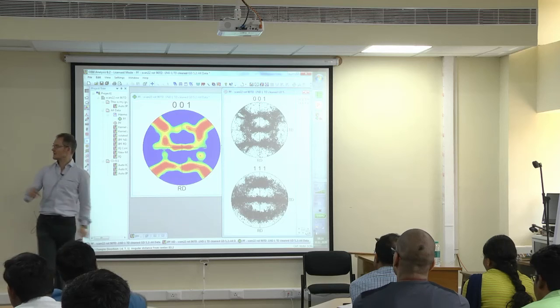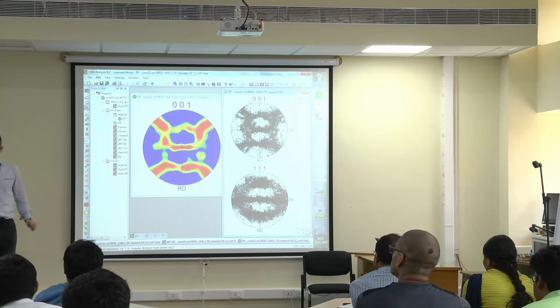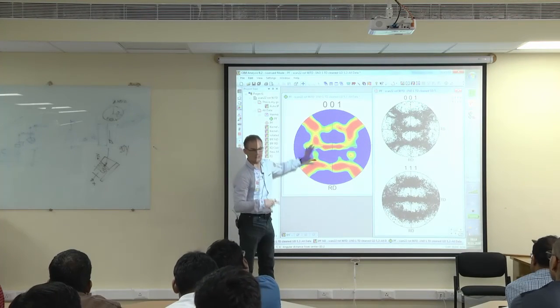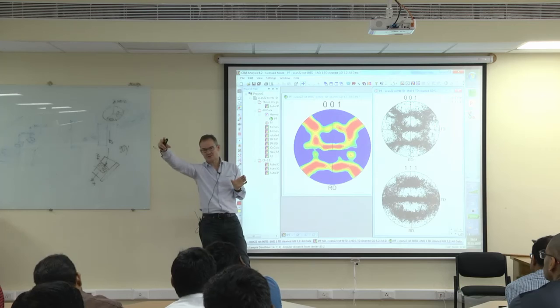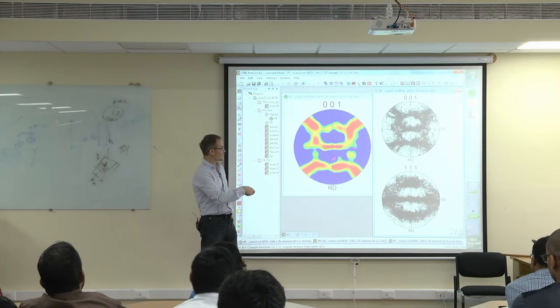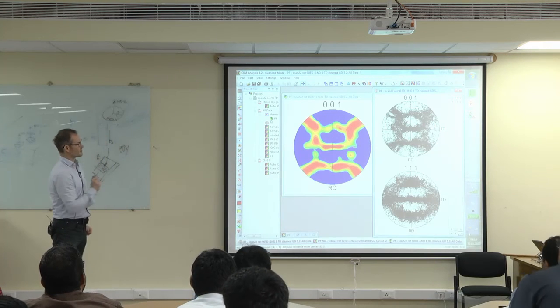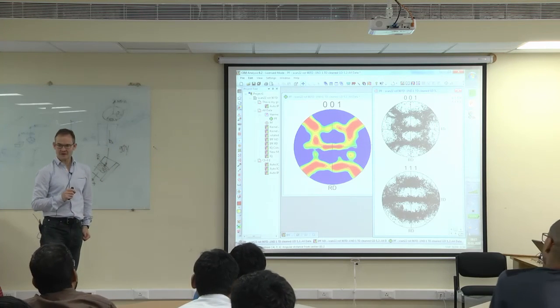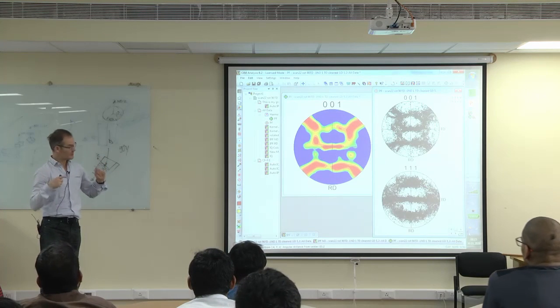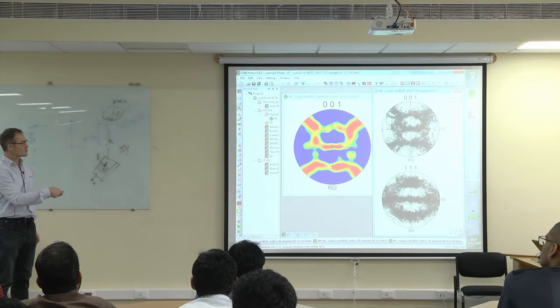And that shows probably in the map which we have seen, it's not enough grains. Obviously there's a part of the texture missing. Probably you would go to another place of the sheet, you would find more pixels of this orientation here. So you can see from this that this is most probably not enough measurement to be really representative of the texture.